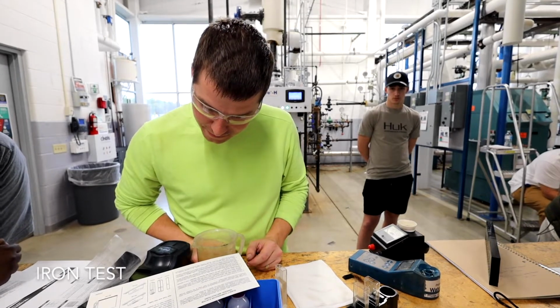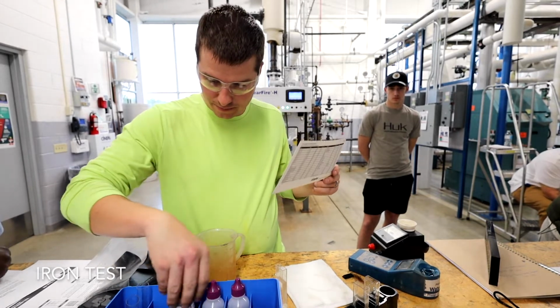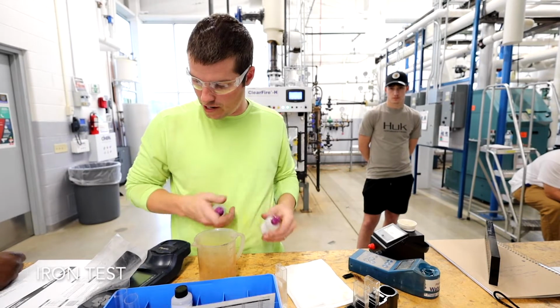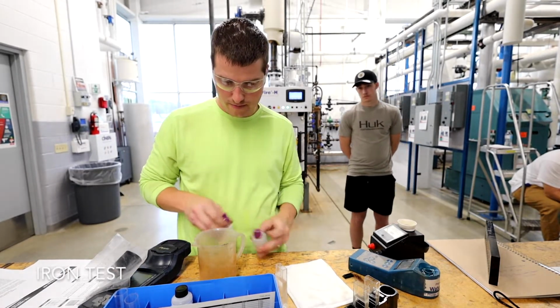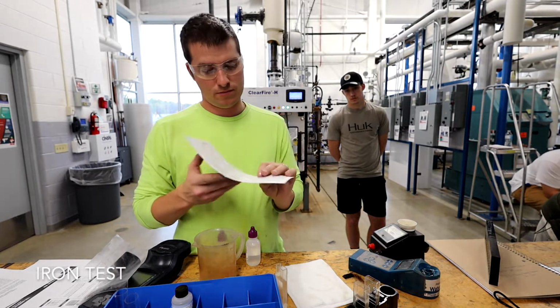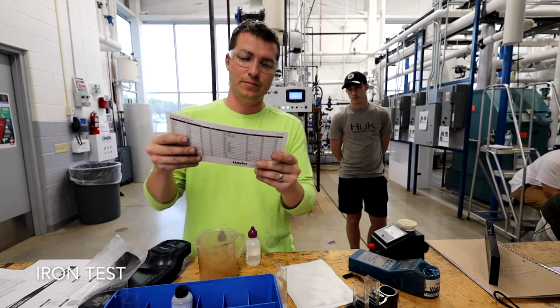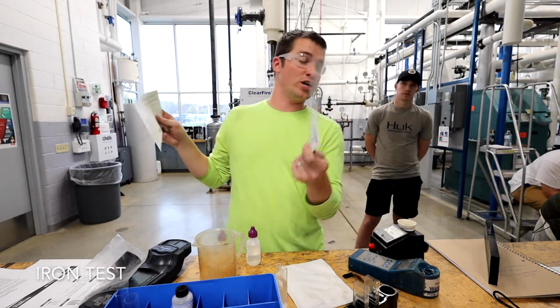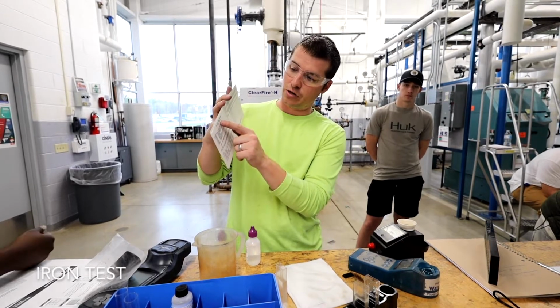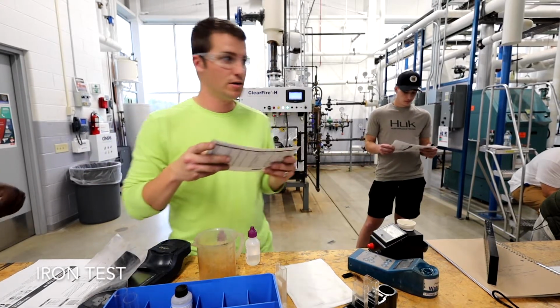All right, now, let's see, next step. Iron reagent 1 and iron reagent 2, okay? Now, here's the interesting thing about this specific one. There it is. So those are general guidelines. Then there's actually going to be this one here that's going to say color comparison test, iron 0 to 2 ppm. It's somewhere on your sheet there. Second page, okay.